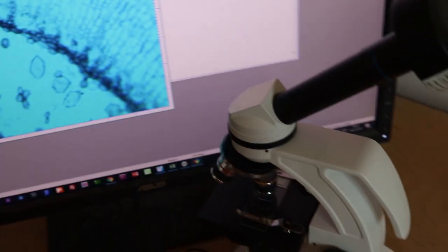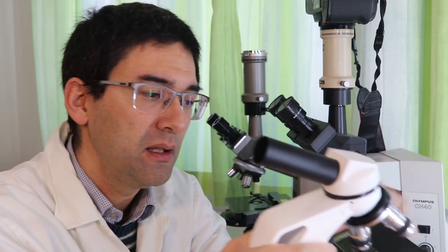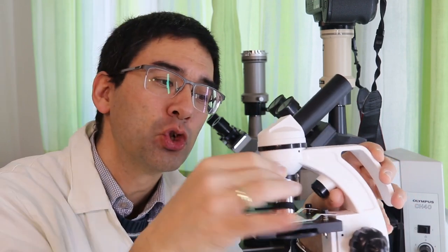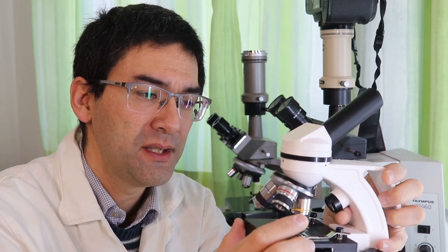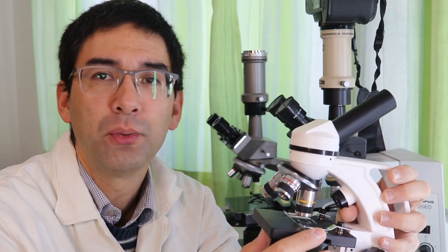So, in summary, not in summary yet, last point, something that is not a big problem, but that I think simply has to be mentioned. Two more things, as a matter of fact. The objectives are not parfocal. This means when I have it in focus using the 4x magnifying objective, I cannot directly switch over to the 40x because I will end up crashing into the stage. I have to refocus over the 10x objective. That is one issue that I noticed. Also an issue of low-cost objectives. Not a big problem, I would say.